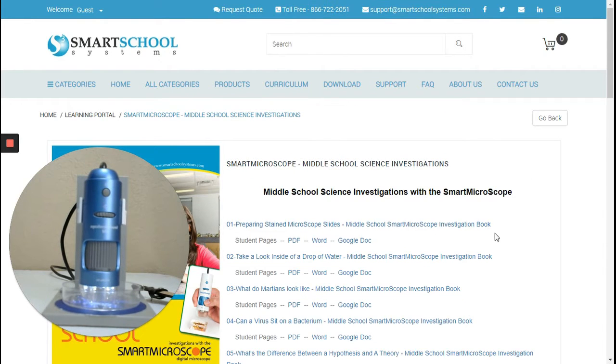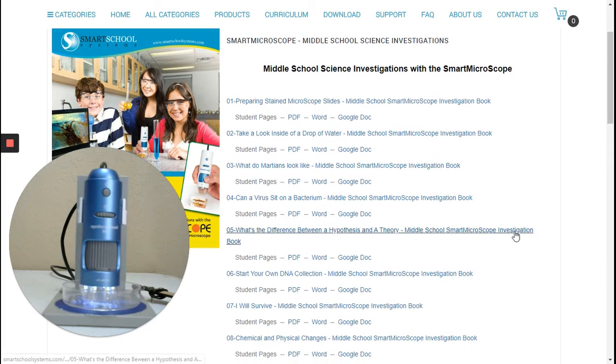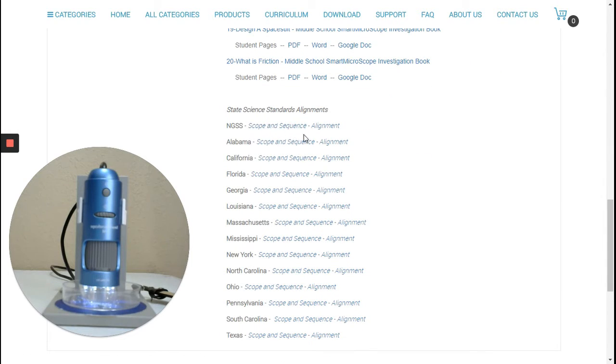Let's take a look at the middle school investigations in the Learning Portal. Each investigation is accessed by simply clicking on it. It includes student pages that are available in PDF, Word, and Google Doc. If you scroll to the bottom, you can see links to the alignment for the NGSS and many state science education standards.